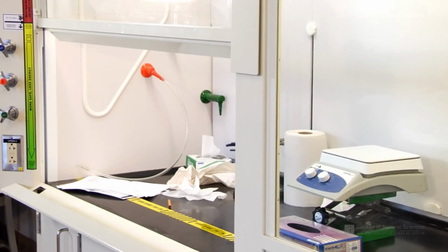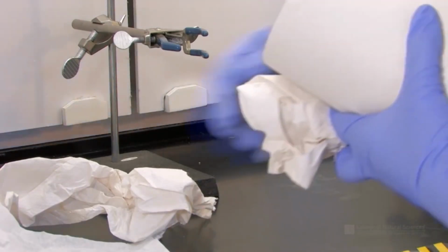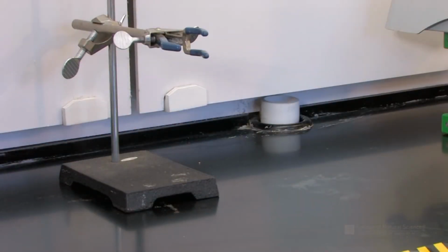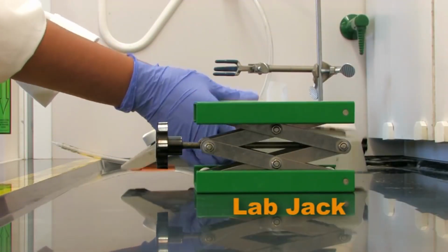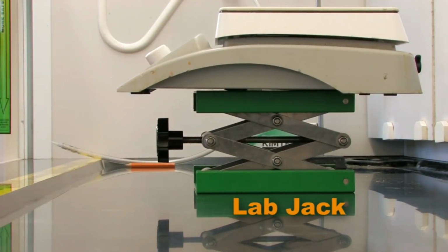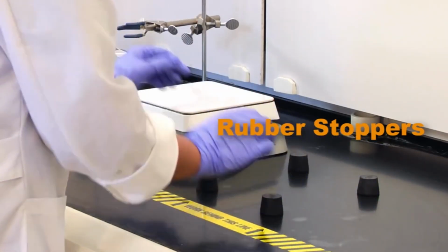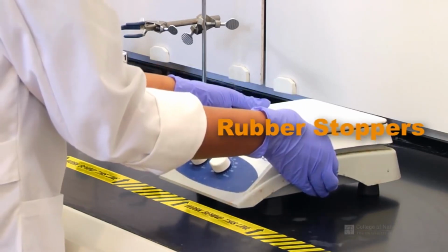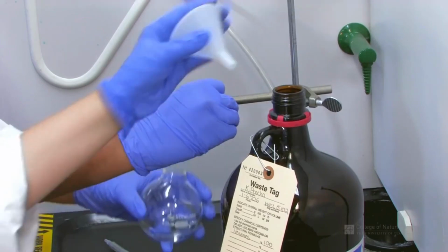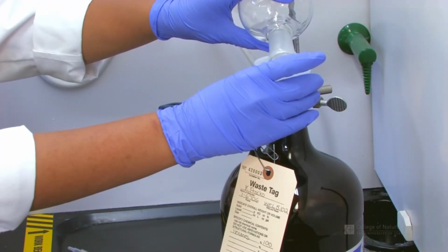As a general rule, paper and other combustible materials should be kept out of the hood to avoid clogging the ventilation system and to minimize potential fire hazards. Large equipment should be raised by about 2 inches to promote airflow below the equipment. This can be achieved using lab jacks or by putting rubber stoppers under the 4 corners of the equipment. Open bottles of chemicals or chemical waste should not be stored in the hood, and chemicals should not be evaporated in the hood as a method of disposal.